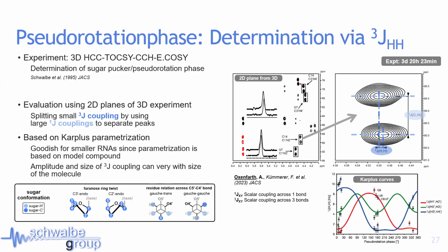So if we use the 1' position as a filter for a 3D plane, we actually can get these planes quite nicely, even for larger RNAs, and we have done so many times in our lab. And the best thing, in my opinion, is that everything that is non-canonical, so everything that is actually interesting, often has a very unique chemical shift. So we have no problem with spectral overlap in these cases whatsoever. So we are actually able to probe all the important stuff using these experiments quite nicely.